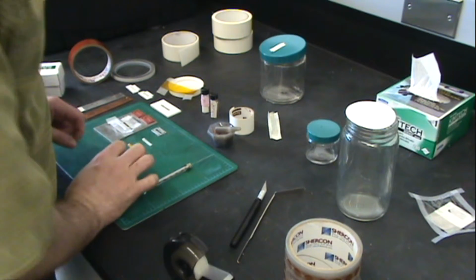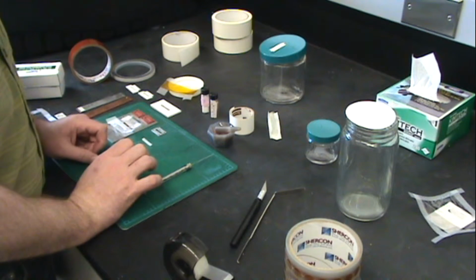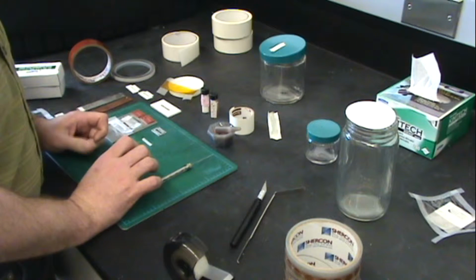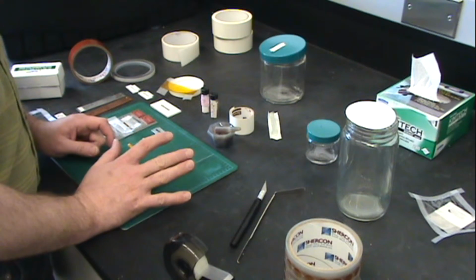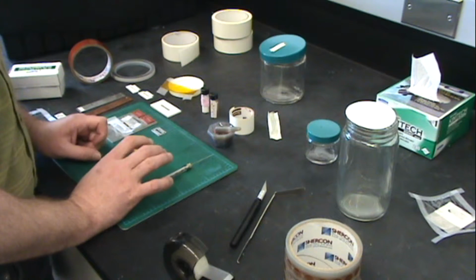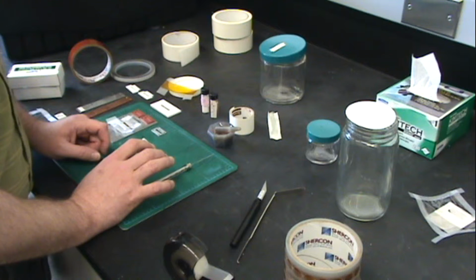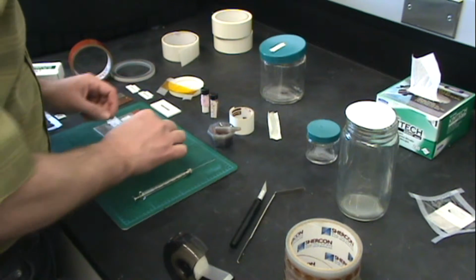Alright, so now let's look at sample cell preparation and sample loading for beamline 7-3, 9-3, 4-1, so hard X-ray measurements either with transmission or the multi-element germanium detector set of fluorescence measurements. So let's start with solution samples.